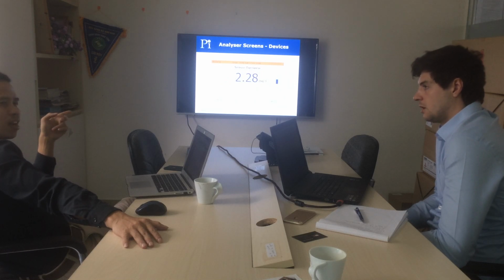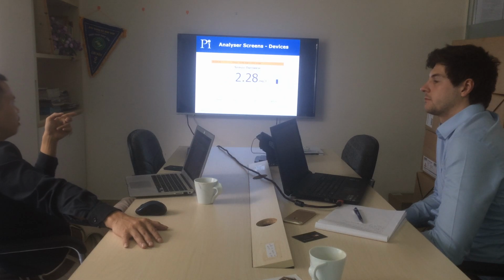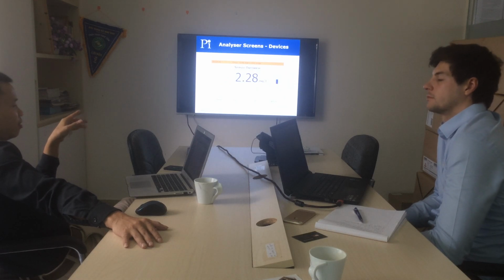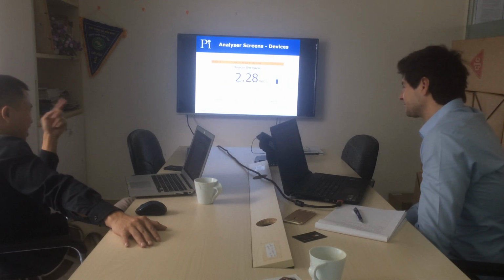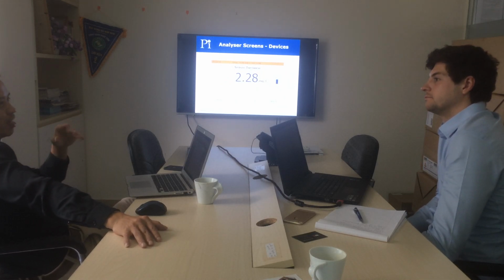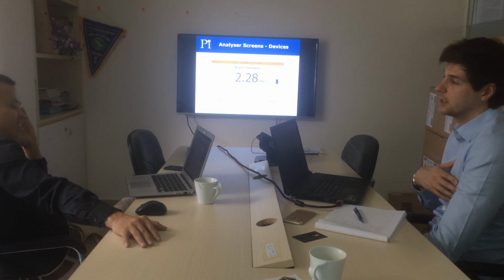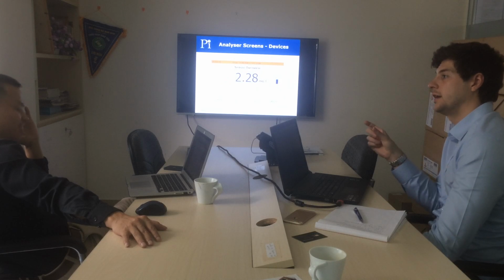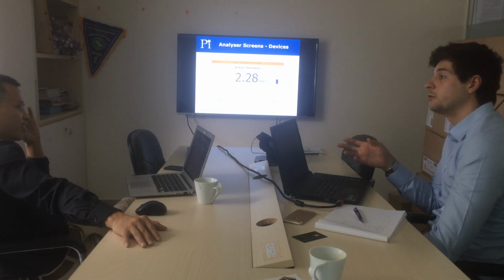In this case, right now the power plant requires ammonium at the moment. So I'm thinking about using the analyzer of this brand and the sensor from another brand. Yeah, exactly. We don't provide the ammonia analyzer, but if it's got a 4 to 20 output, then we can accept it. The same with flow meters.